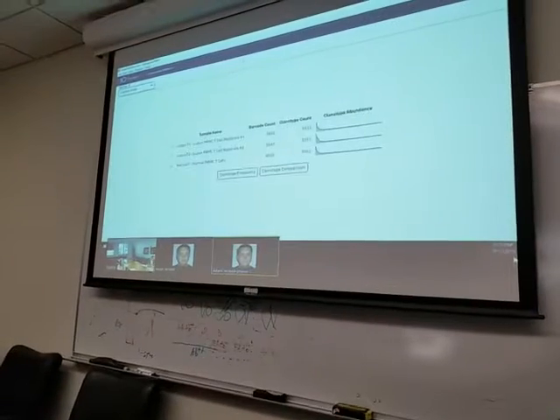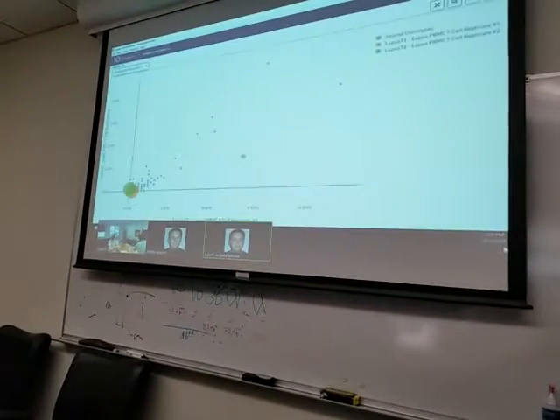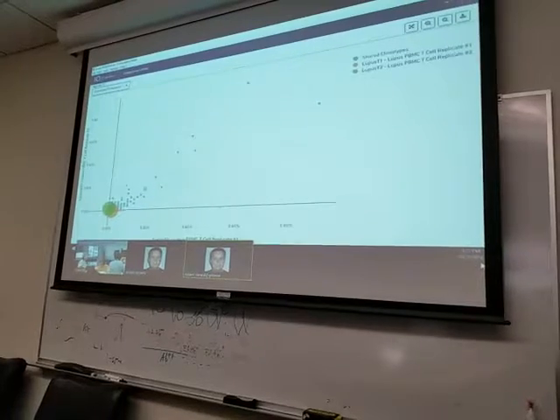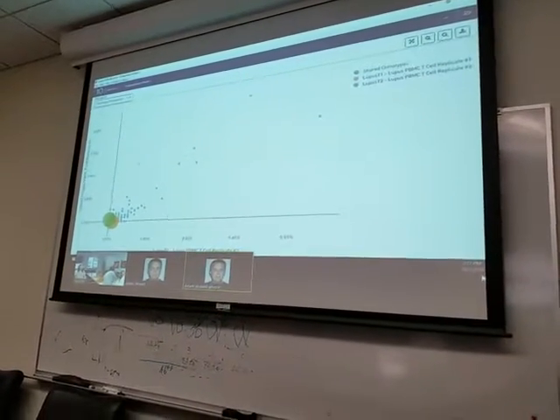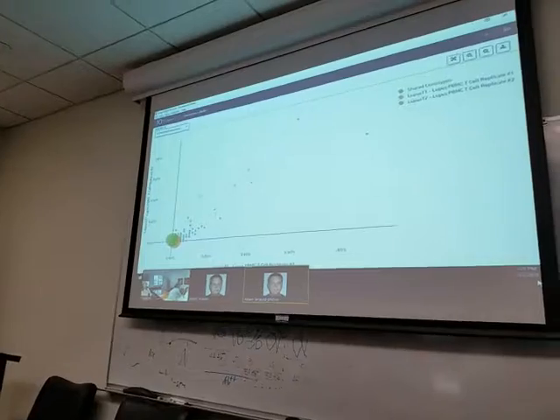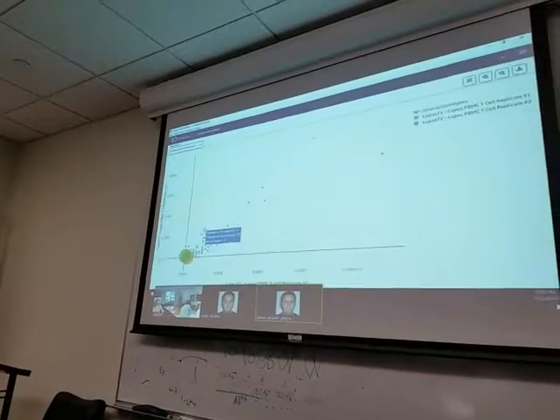But if I do a comparison between two technical replicates, now we can see all of the clonotypes they have in common, and that they're overlapping. So you are able to do some comparison. I mean, it's limited, to be sure. It's pairwise, but it does give you a little bit of the capability to do that.